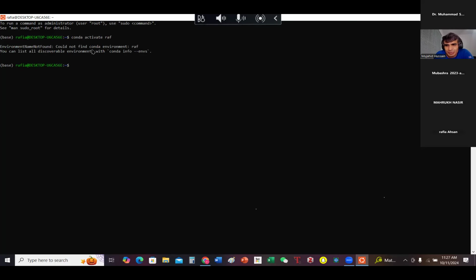You need to type this command. Conda create. First, you need to create your environment. Conda, space, create, and space, double hyphen, name. Then any name you want. Space after name.